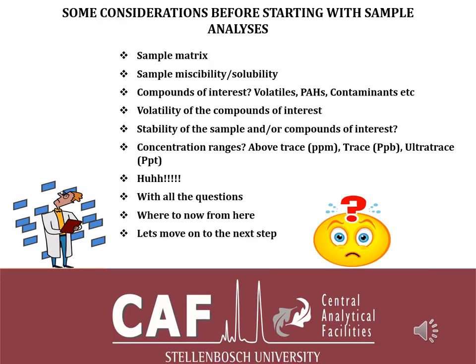As mentioned in my introduction, there are some important things that one needs to consider before analysis when it comes to sample prep. The sample matrix is very important. When we talk of sample matrix, we're referring to the question: what type of sample is it? Is it a solid sample? Is it a liquid sample? Or is it a gas phase sample? The reason why that is important is that it can determine which sample prep you will perform.